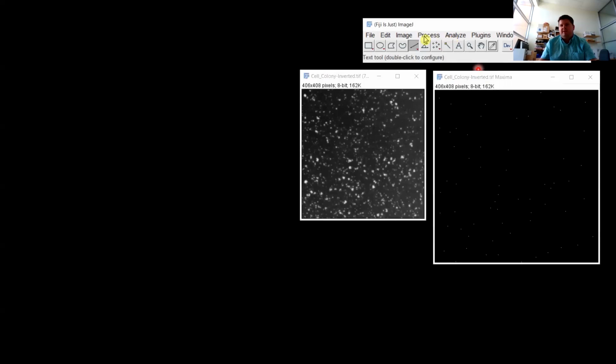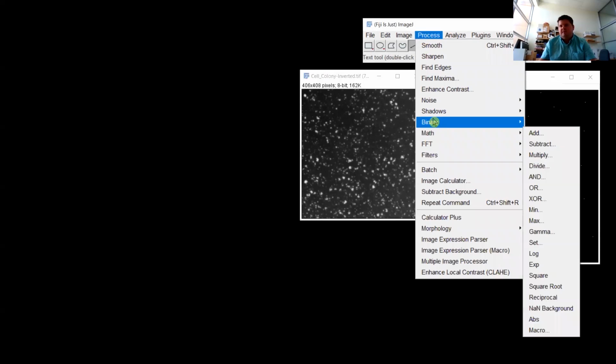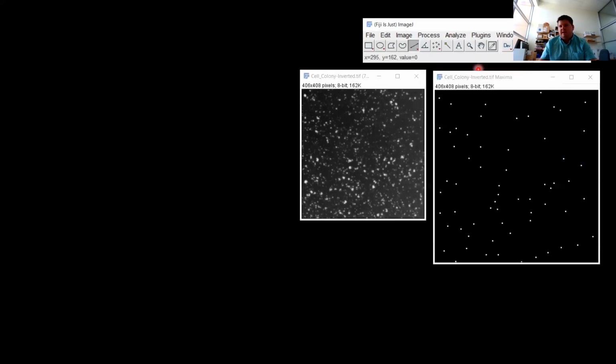Because this is just a binary image, you can dilate those points a little bit bigger so they're about the cell area, analyze the particles, and then go through and ask, is it red or green or whatever the stain was. So that's one use case for it that I've found.